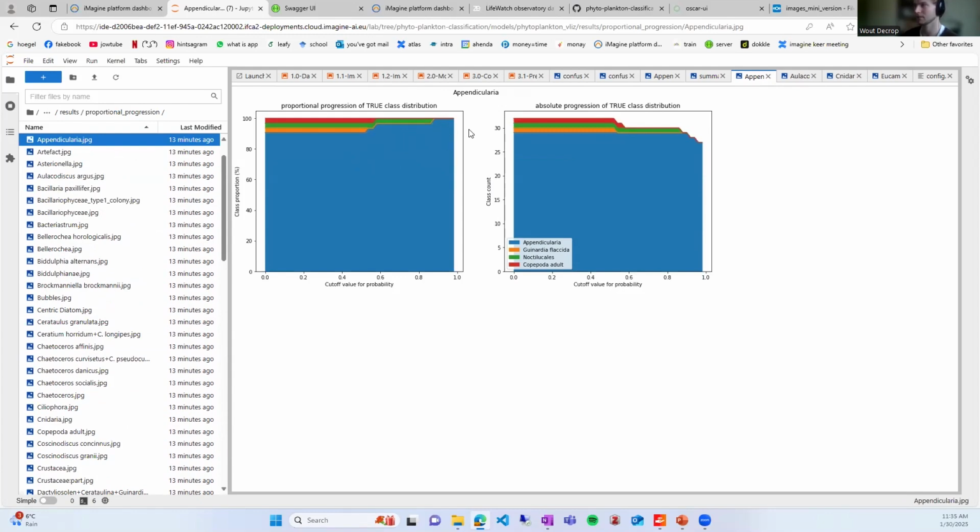And here, like I mentioned before, you can put it at 90% and say, hey, I lose this amount of data. So for this data, I approve. I say 90% correct, the data that is correct here. For the remaining data where the confidence is less than 90%, I'll take a look at it, and it will be this part of the data. And then you can see, hey, this is wrong, this is wrong, this is wrong, this is right. So it kind of speeds up the process of the human annotator.